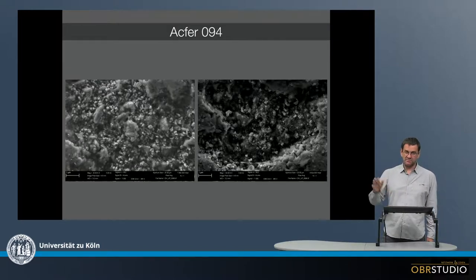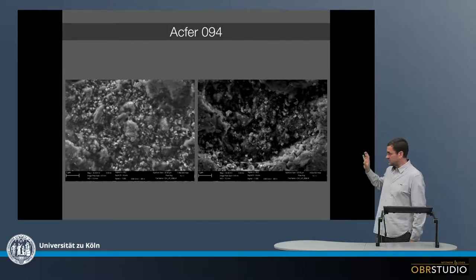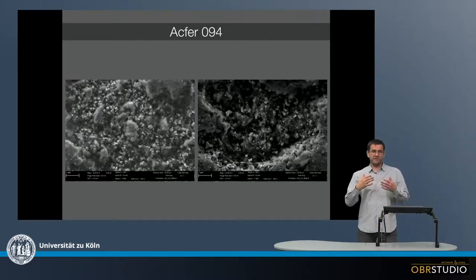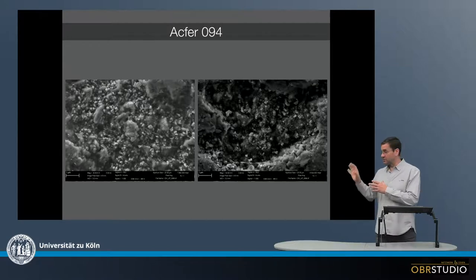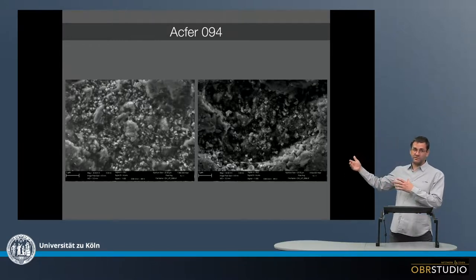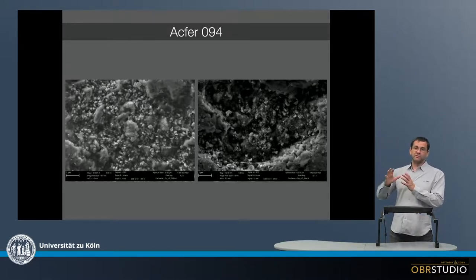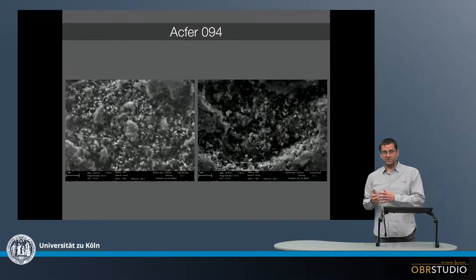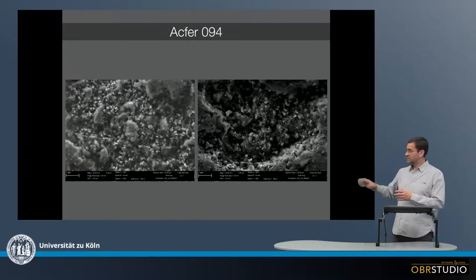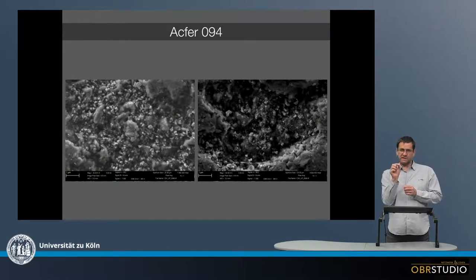But again, unfortunately, it's very difficult to make an analysis here. Although I have to say, when I'm saying it's difficult to make analysis, I mean with this technique, which is secondary electron microscope. It is, of course, possible to get analytical results here by using a transmission electron microscope. But if you would use this, it's not possible to make these kind of pictures, because in a TEM, we look at really very tiny nanometer size grains, so the entire field of view would be just a few nanometers or tens of nanometers, something like this.